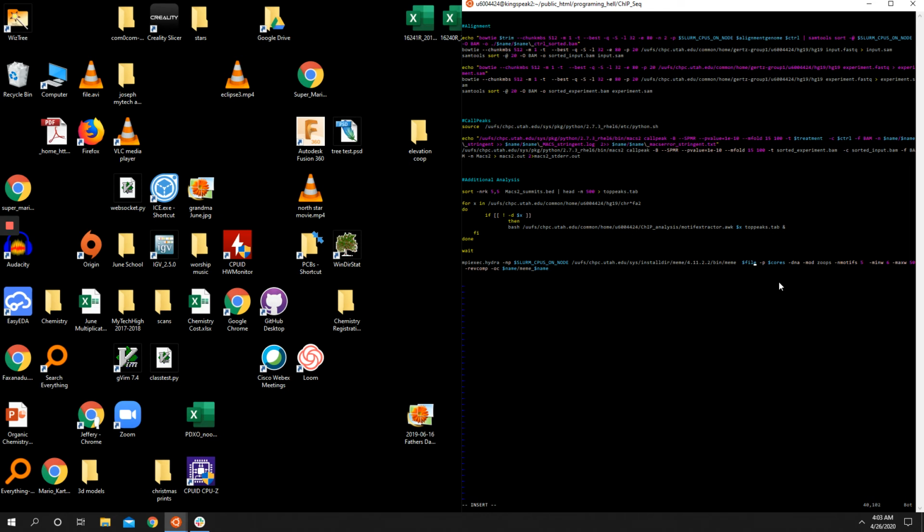And we give it our file that's coming in, which will be, what did I say that name was? Let's see here. The name of it was peekseek.fa.